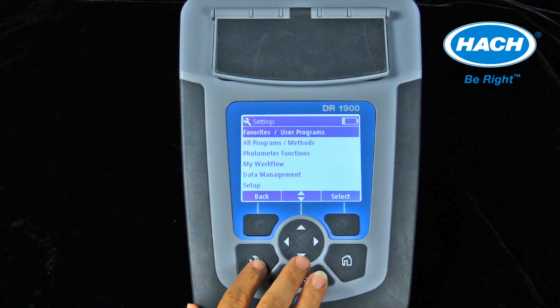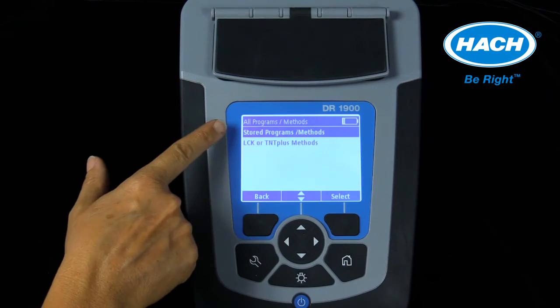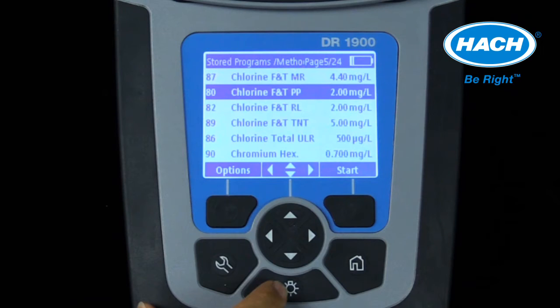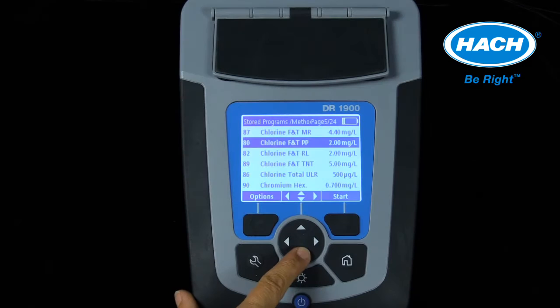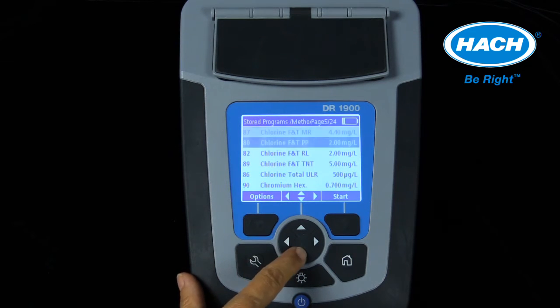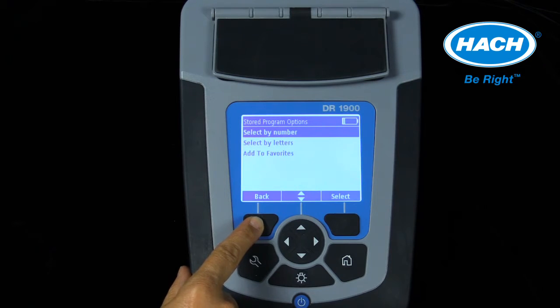The DR-1900 software is easy to navigate and define the correct stored program. Stored programs are all located using the wrench key and selecting all programs methods from the list. The menu then splits into either stored programs or LCK or TNT Plus methods. After selecting stored programs and methods, the full list of parameter and method numbers are visible. The DR-1900 has 220 stored programs, so navigation of the list can be simplified by selecting the following navigation keys. Right and left arrow keys scroll by page. Using the options key allows for the stored program to be selected by numbers or letters. Programs that are accessed often can be added to the favorites list for easy use in the future.